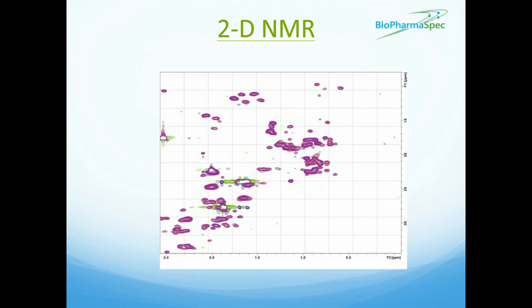So again, you're trying to increase your intensities and signals to look at any differences. What you're seeing here on the screen is an overlay of the same biosimilar against 2 of its RMPs. Again, you can see a very good overlay of the spectra, and the only differences you see here were attributed to differences in the buffer excipients.